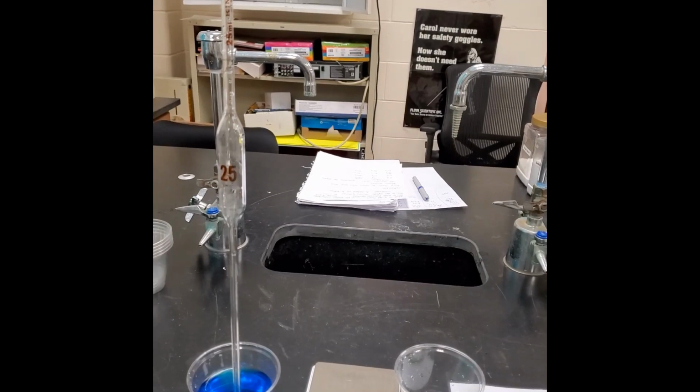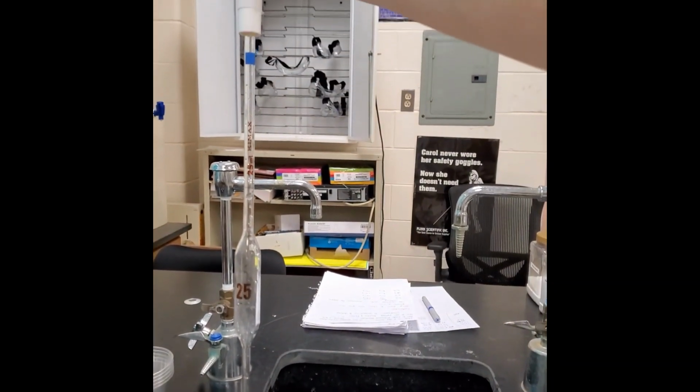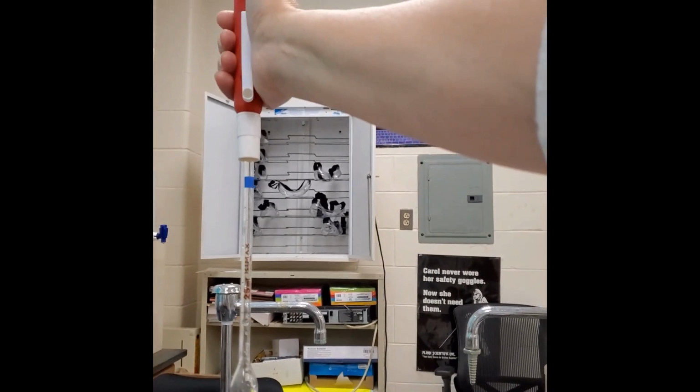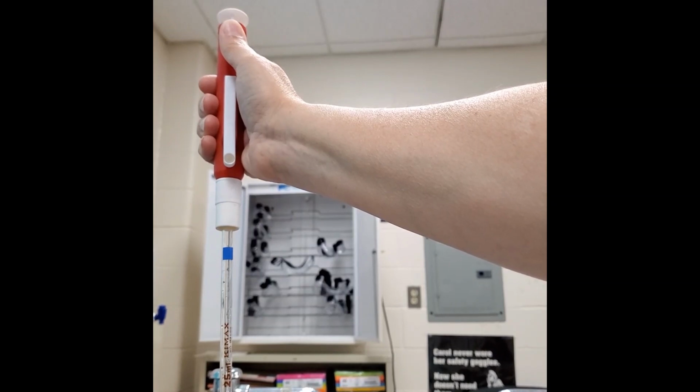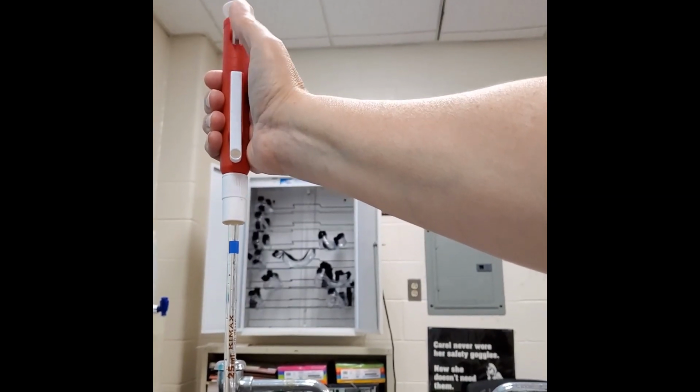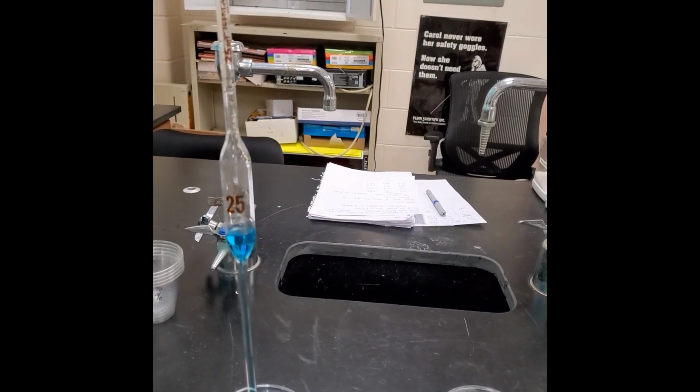Okay, so while it's in the solution, you are going to dial this slowly up, okay? And as it dials up, if you look down here, the liquid starts to come up.